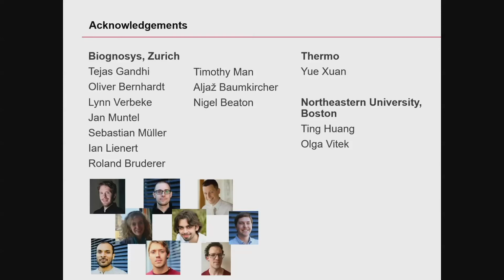I rather meant the library though. When you're deriving the library iRTs, we've always done this by just taking the median or something like this of the MS2 scans where this peptide sequence was identified. But you could imagine, now that you're getting down to these very fine tolerances, having an MS1 feature-based retention time that might be more accurate. Is that something you thought about?